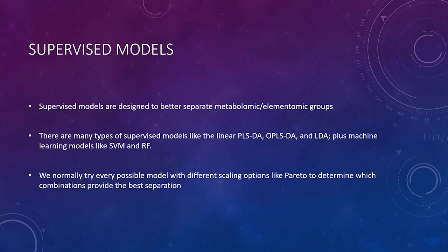And right now we're working with the Queen's University computer gurus, and we're trying to automatically model all of our data on all of these model platforms as soon as we produce it. Half the time, or sometimes more than half the time, we spend in the laboratory and in the office is modeling data, because the data sets are so large that it takes a long period of time. So right now we're working with this group at Queen's University to try and do automatic modeling of our data, and that's going to save us a lot of time in the future.